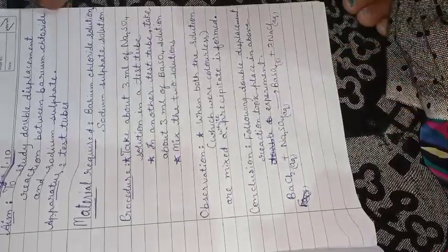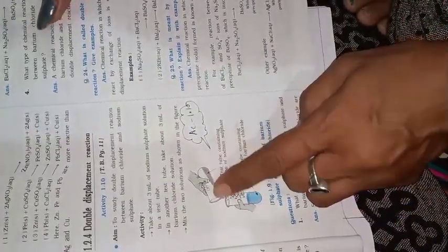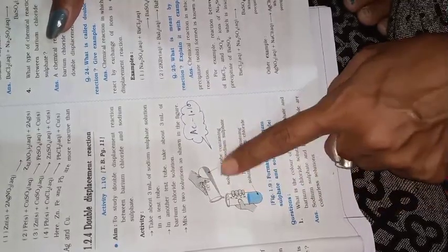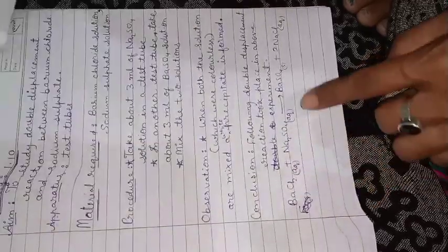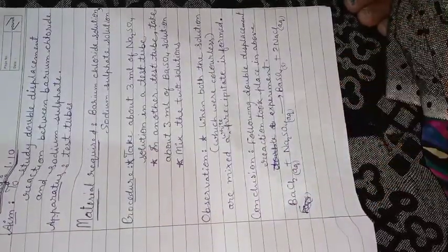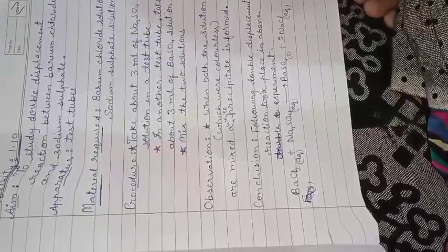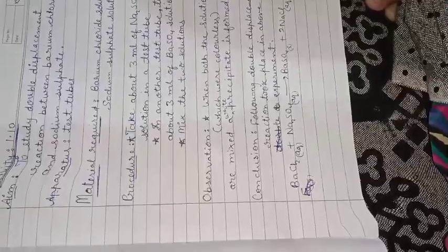So we can see in this figure that in one test tube sodium sulfate is there, in another test tube barium chloride is there. Both the solutions will be mixed and we will get the PPT of barium sulfate. So in this way we have completed our activity number 1.10. Now we will go towards activity number 1.11.